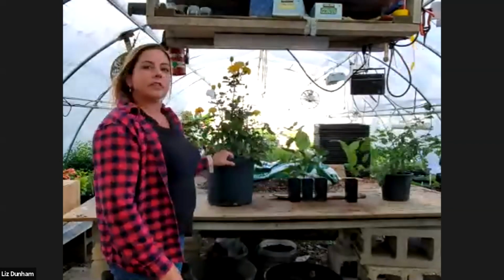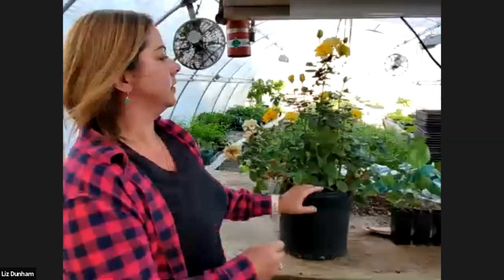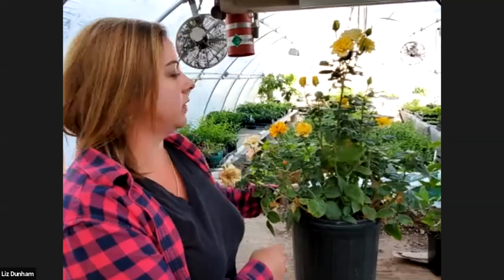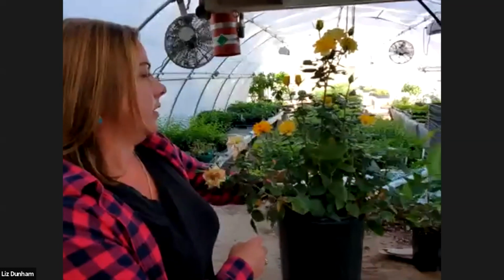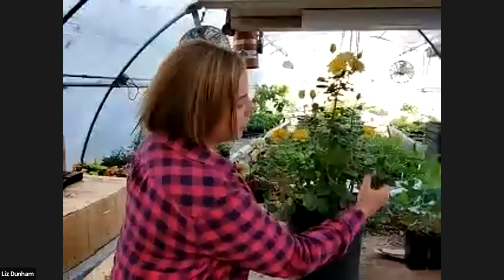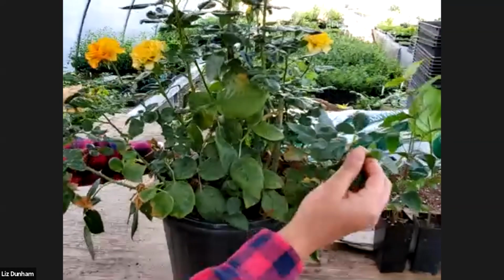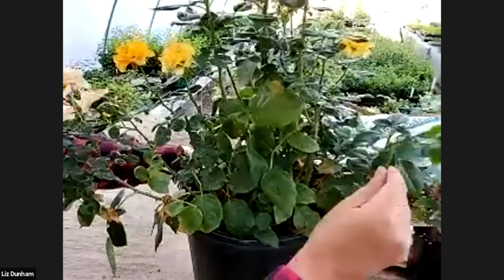So this is the kind of plant that will come in for a new isolation. So this is Elizabeth Ashley Rose from Anthony Hoke at Silver Falls. And we will manipulate this plant in a way where we can get new cuttings from it. We're looking for something to put in the culture. Well, there's not really anything on this right now. It's too late in the season.